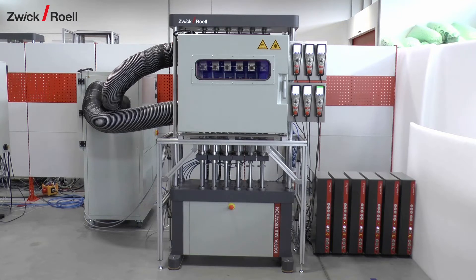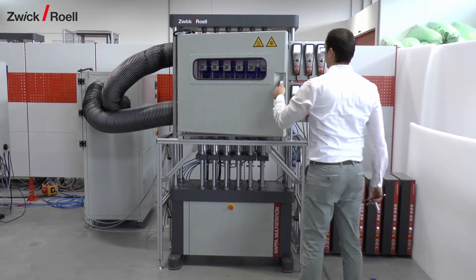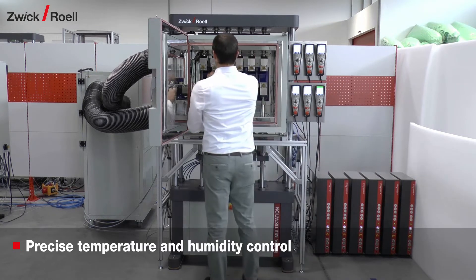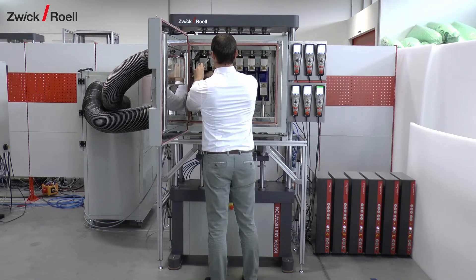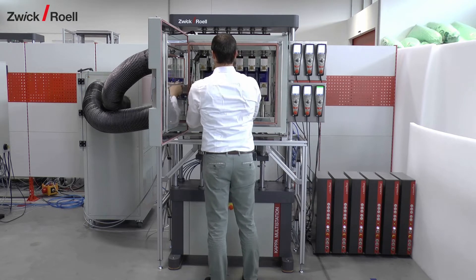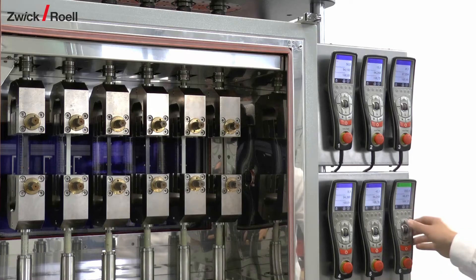The multifunctional electromechanical creep testing machine, Kappa Multistation, performs creep tensile tests on plastics in a climate chamber. The demand for tests in a controlled temperature and humidity environment is increasing rapidly. The relative humidity can be controlled from 20 to 90 percent at temperatures from 20 to 90 degrees Celsius. Without humidity control, a temperature range of minus 40 to plus 250 degrees Celsius can be achieved.